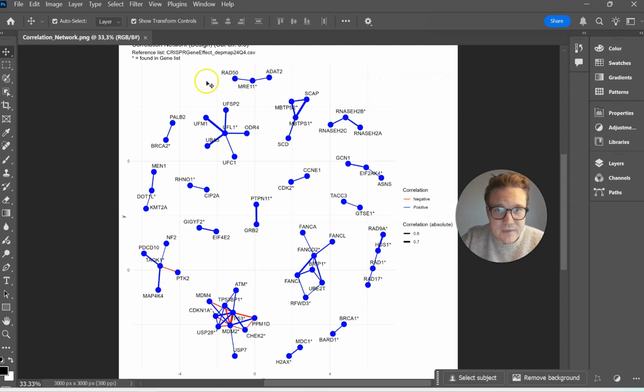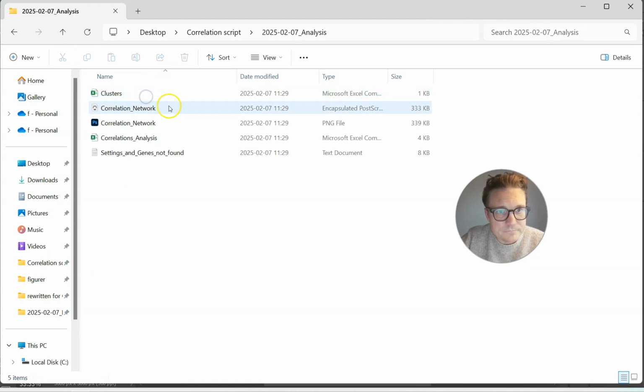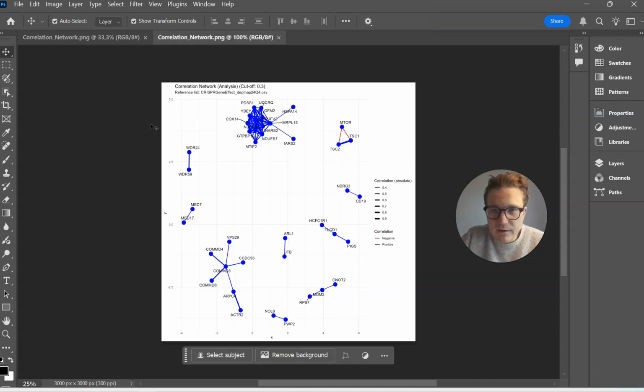Okay, good. So with that, I've shown you software that could be used to identify links between genes. Now I used it in the design mode. I'm not going to do it, but if you used analysis mode, you can get images looking like this. Here all the genes were paired. This is actual data from an actual CRISPR screen. When you are at that early stage of getting the gene list, it could be very useful to start generating these to understand, okay, these genes might be connected.